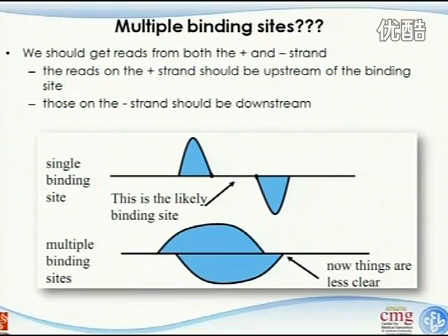But once you get rid of things, you probably want to do some manual work to look at whether these sequence reads tend to cluster together. Another thing you might also want to try is, for a region like this, once you have identified it and you are ready to get rid of it, before doing that, look at the sequence features in this region to see whether there is possibly some kind of dimerization or trimers in these regions, because sometimes the proteins do work in that way. Okay.